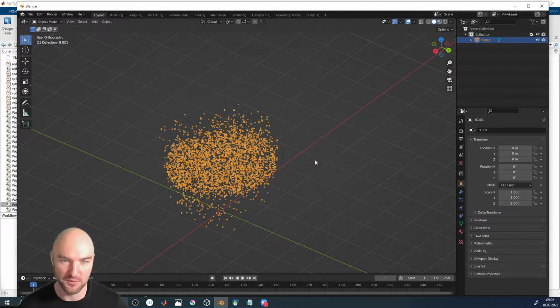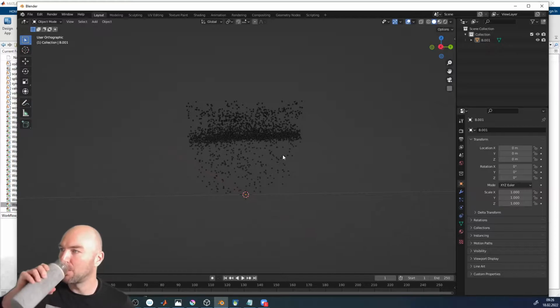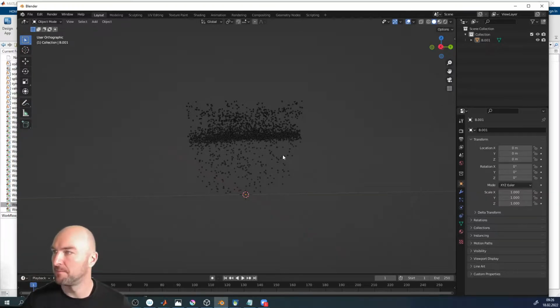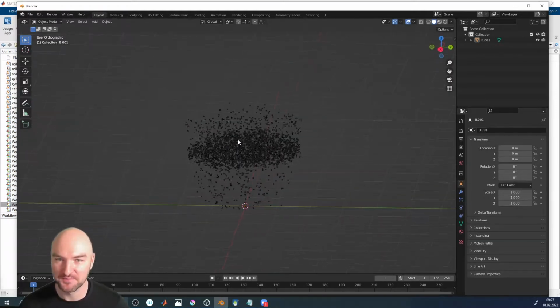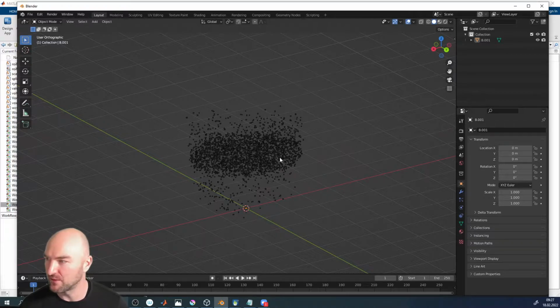And what we want is to outline a grain boundary. Does everyone have some data in Blender now? Yep. Oh, I see a lot more green ticks than yesterday. That is brilliant. I think the rest is still asleep, probably, right? So yeah, the next thing we want to do is actually create an object that outlines our grain boundary.